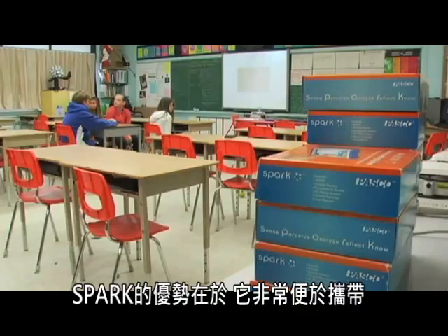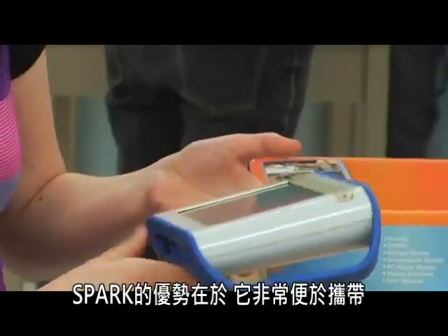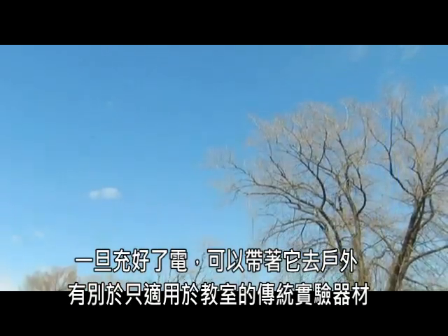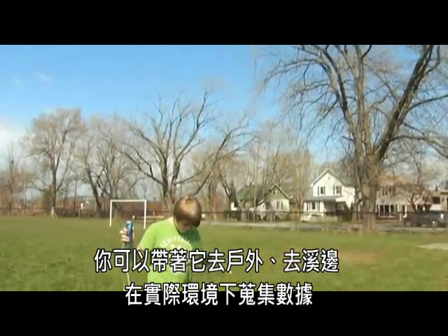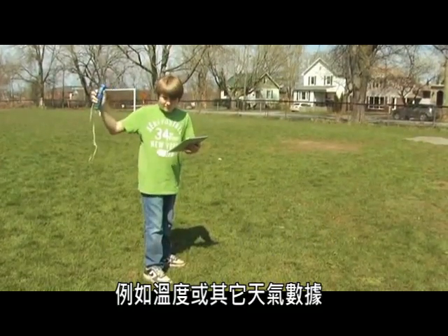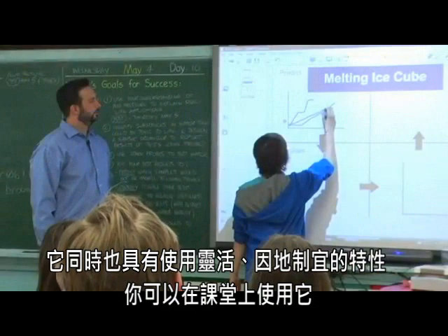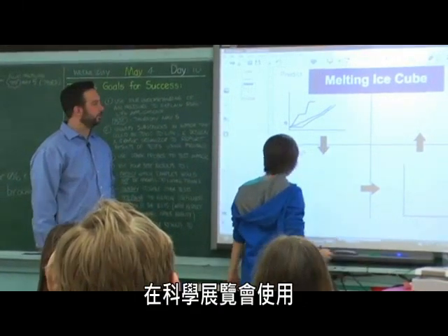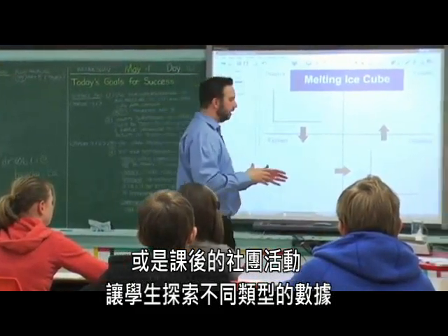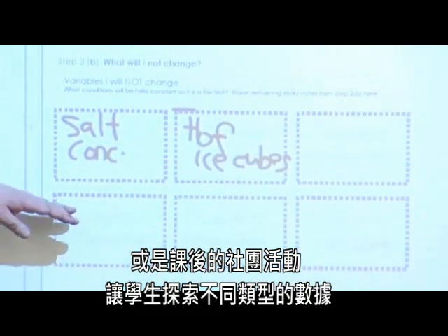The nice thing with the Spark units is that they are very portable. Once they're charged up, you can really go out into the environment and collect data outside traditional classroom settings. So that's nice if you go down to a creek or outside to get temperature or other weather type of data. It's also flexible enough that you can use it with whole class situations, but it's also been appropriate sometimes, if you have science fair clubs or after school science clubs, to have students explore different kinds of data collection at that time too.